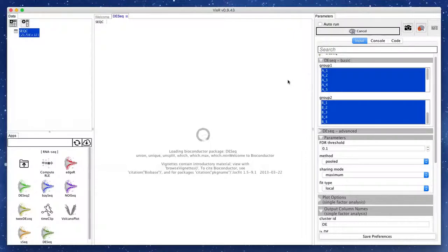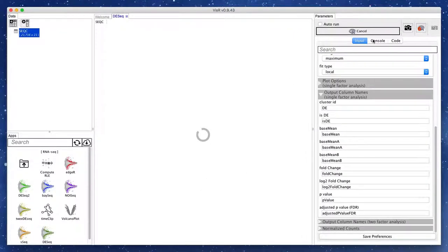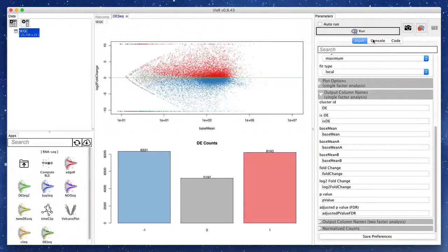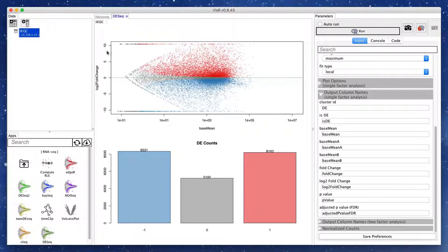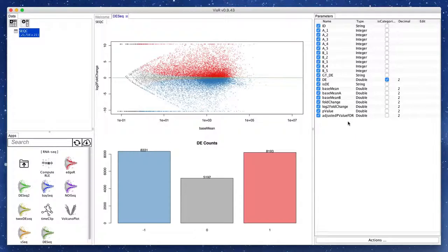VizR will then run the DESeq method with the specified data and parameters. Once done, it outputs a scatterplot called an MA plot as well as a histogram of the detected differential expression states. These labels as well as other computed statistics are added as new columns to our data table.